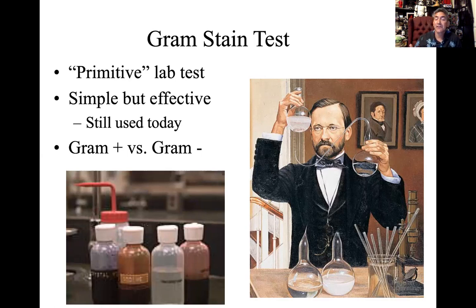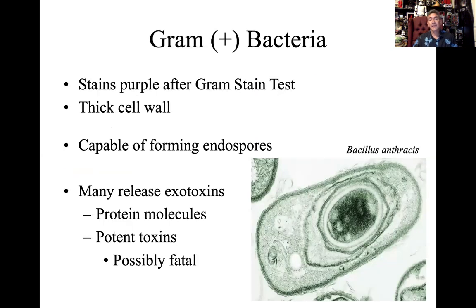So now let's look into what these results mean. What if it's Gram positive? What if it's Gram negative? Let's begin with the idea of a Gram positive bacteria. Visually we're going to be able to tell because we're going to see a purple stain. After we do all 4 chemicals, the bacteria will appear purple. If it's purple, think of purple positive.